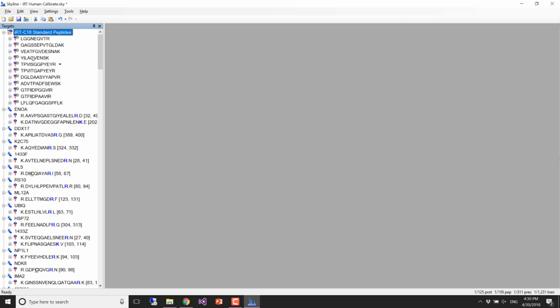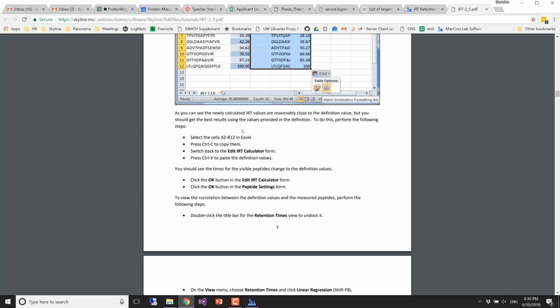Whereas if you just have them in the IRT standards, they're mostly just going to get excluded from quantification. So it's not something I love to see, but ideally it's way better if you can have just disjoint sets. Makes things simpler. Okay, so now I just have to figure out which one they actually measured.